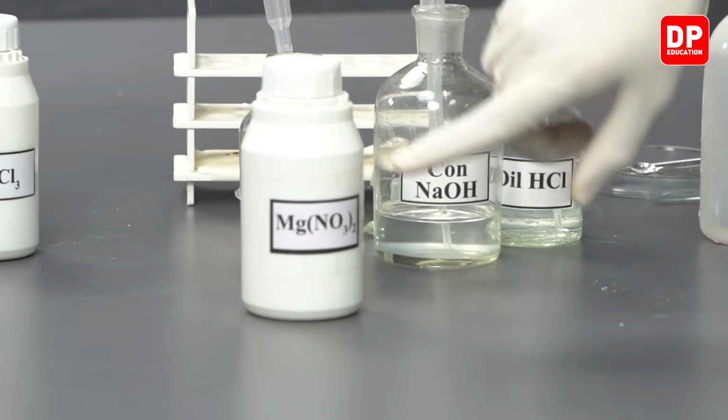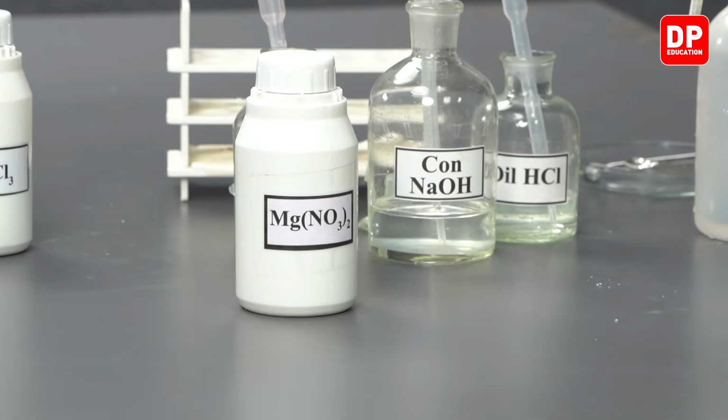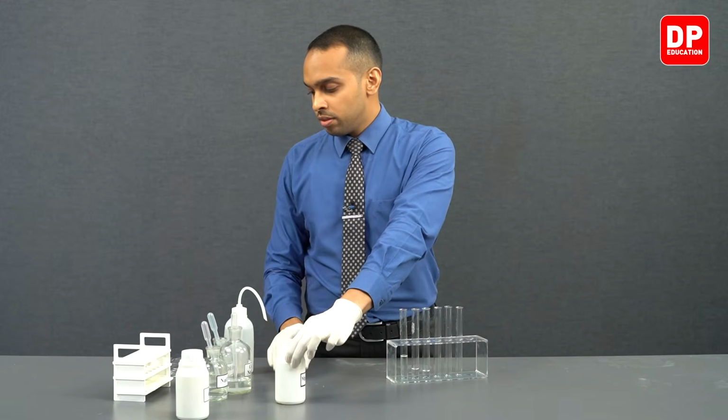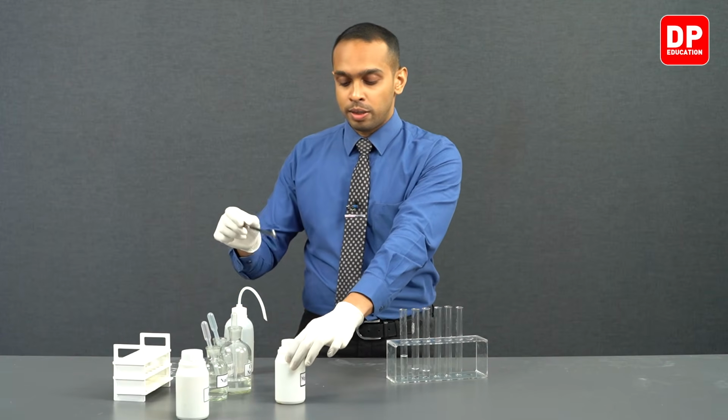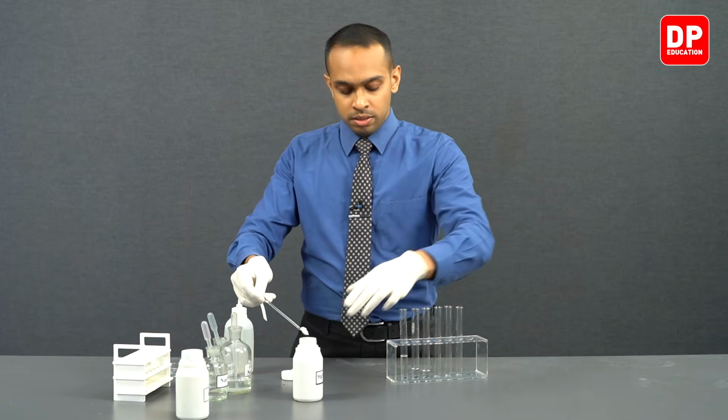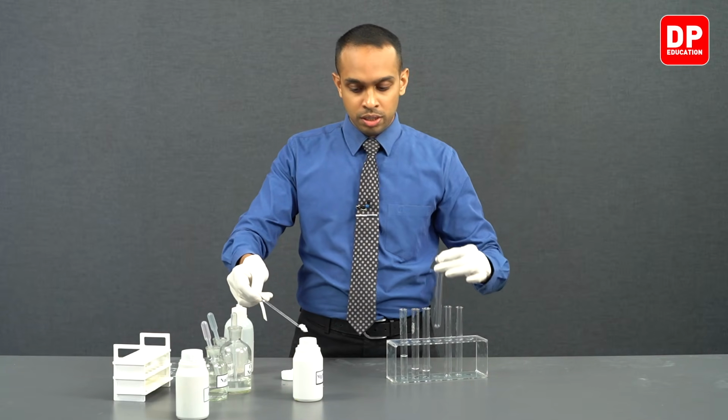Now, we can move on to magnesium nitrate. We have our magnesium nitrate solid sample here. We can use a new spatula to take a small amount of magnesium nitrate into a new test tube.